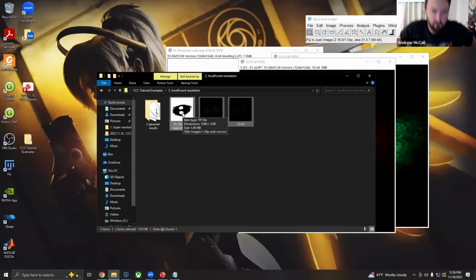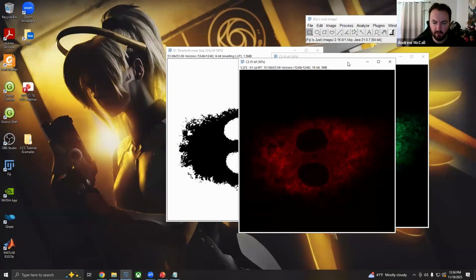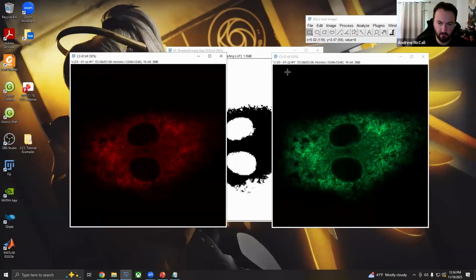And in this, we have a bit of insufficient resolution. So you can actually pretty well see this. This came from a forum post, actually, someone asking for help with CCC.